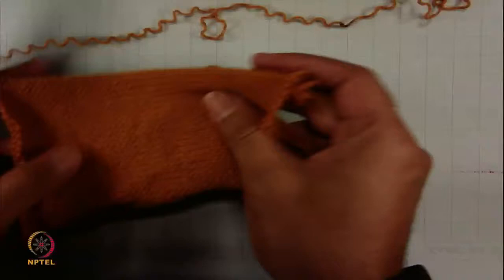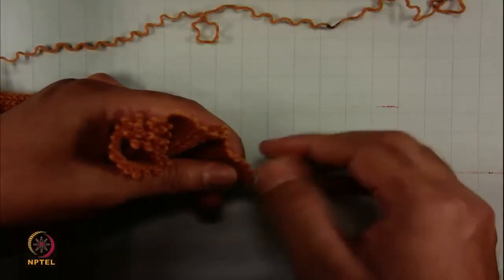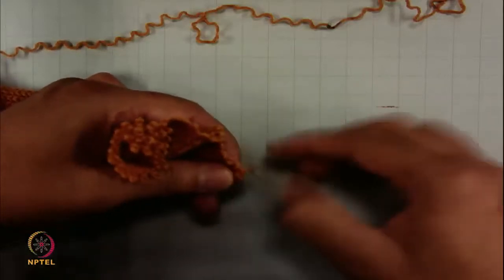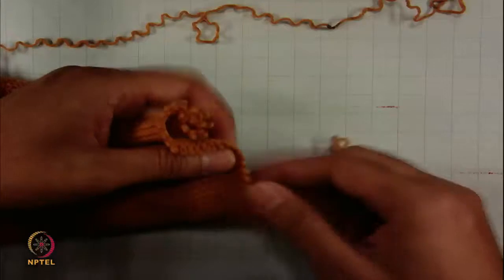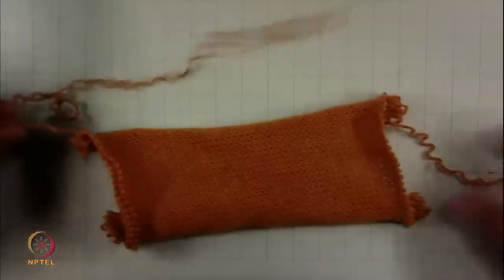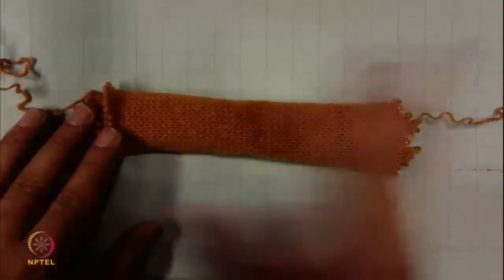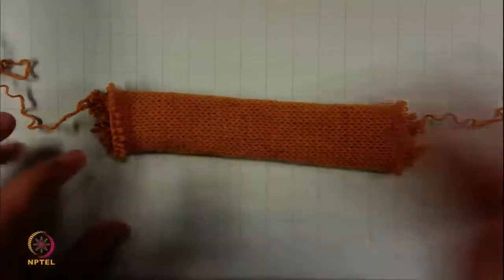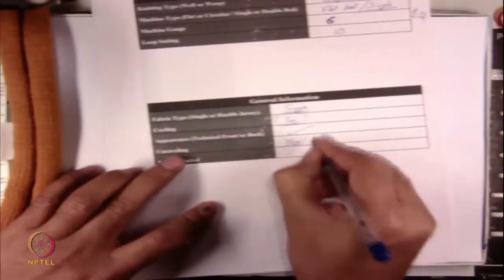If you take the other side also and try to pull the yarn, the same thing will happen. You can see here the unraveling is happening from the other course also. So you can see unraveling is happening from both sides. The yarn can be pulled from both the first course and the last course. So it means this fabric can be unraveled from both sides. There are certain other fabrics, especially rib fabrics, where you will realize the unraveling only happens from the last course. That we will discuss in the subsequent lectures. So yes, from both ends.